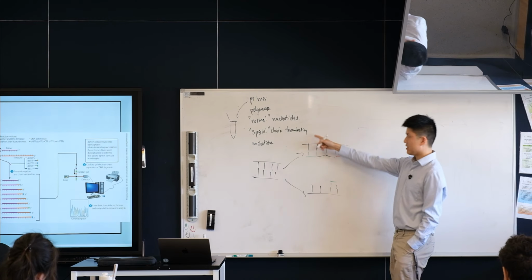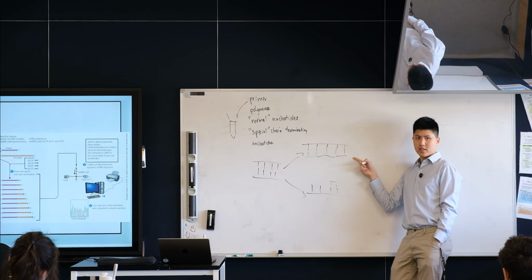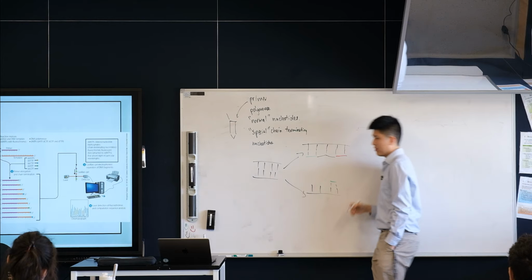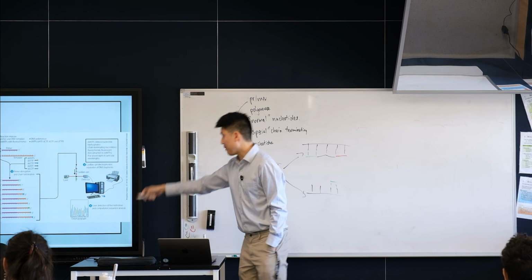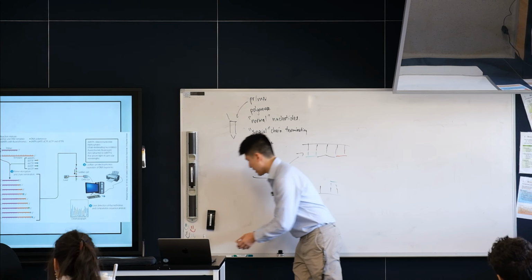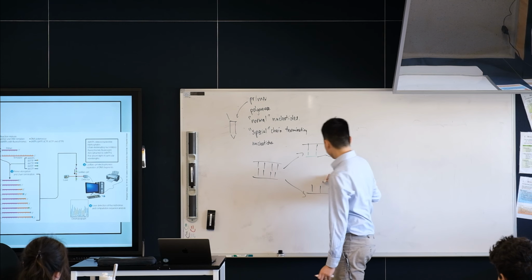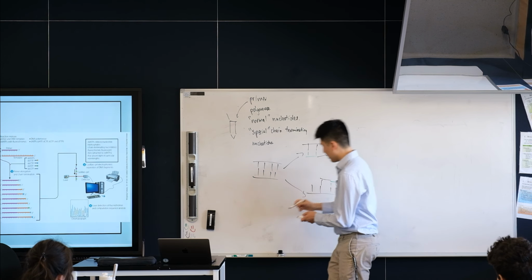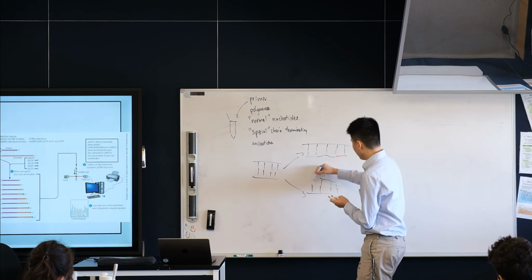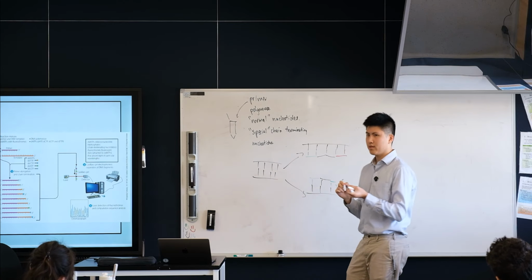After I add one of these nucleotides, this chain stops growing. It doesn't get any bigger, right? That's it, the chain. Now, the same thing can happen for another piece of DNA. Normal nucleotides are being added, but then again, we hit another special chain terminating nucleotide, and then we stop again, like this.